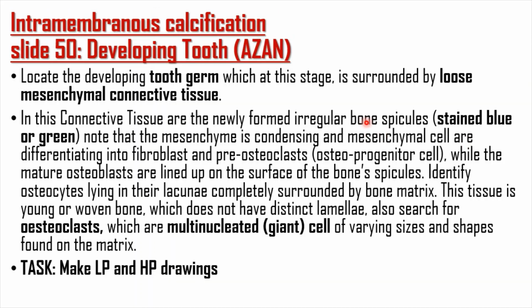All right. Now, we looked at the two types of bones histologically. We looked at the compact bone and showed the Haversian systems, and we looked at the cancellous bone and showed the bone marrow and how the lacunae are arranged in the trabeculae.